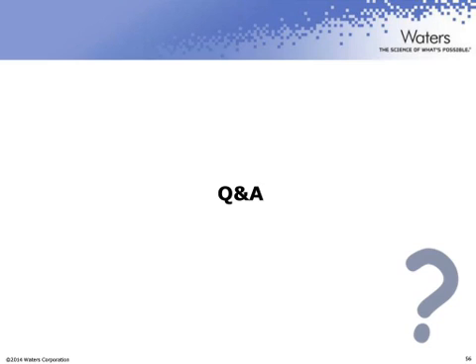Thank you, Tanusha. I think really it's a case for everybody to look at the practice in the lab. I believe the very first thing is to not use actual samples for those trials, or the system readiness checks, so as not to be open to any concerns. I think they should definitely be kept as part of the records in case you need to go back to them. I think deleting them serves no purpose. But I also believe that they don't belong as part of the batch record, because it may have taken some days and 12 system readiness checks before the system was ready, but it doesn't actually affect the final performance of the system.